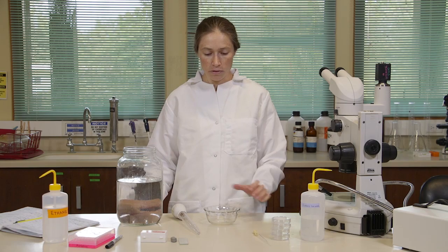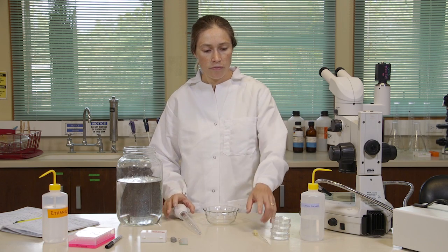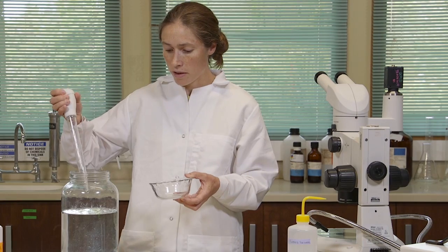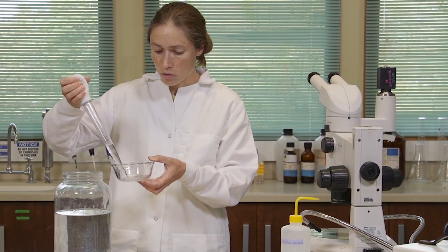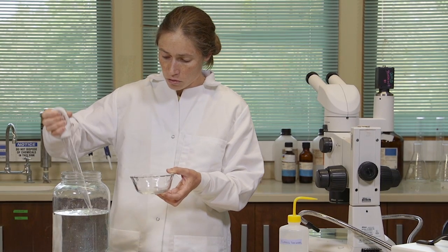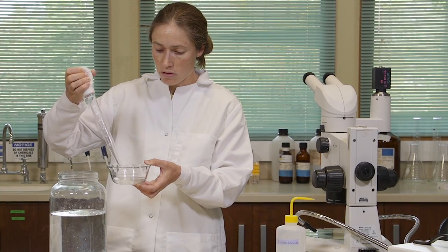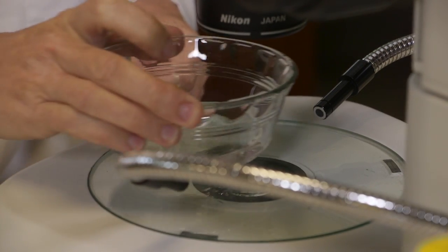To sort the plankton sample, you'll want a bowl, a turkey baster, a glass pipette, some small dishes, and some filtered sea water. Use a turkey baster to move a small amount of your sample into the bowl — maybe one or two centimeters deep — and examine it under the dissecting microscope.